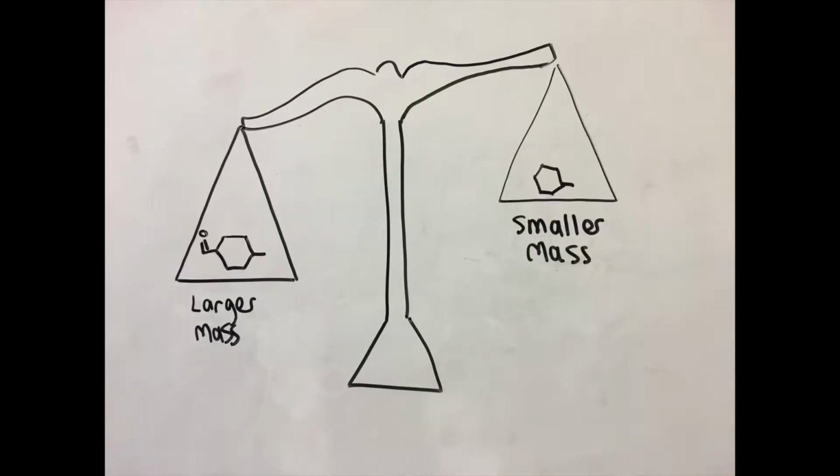MS, our third method, is a technique used to determine the total mass of a molecule of a substance as well as that of major fragments. In this way, MS also helps to determine the structure of a molecule. Its differentiating characteristic is the molar mass of a molecule. We used this because determining the molar mass is vital to determining the formula of our molecule as well as its general structure.